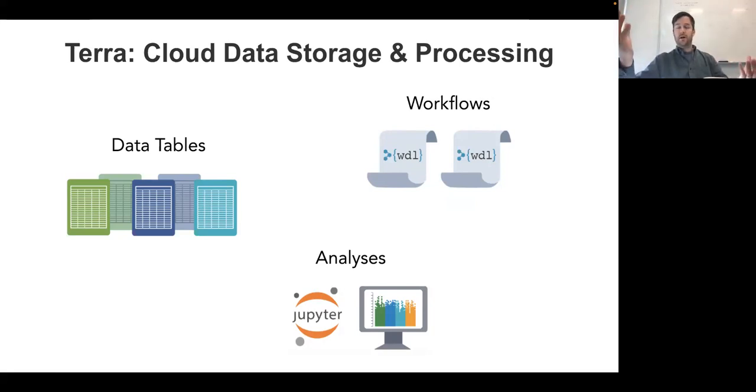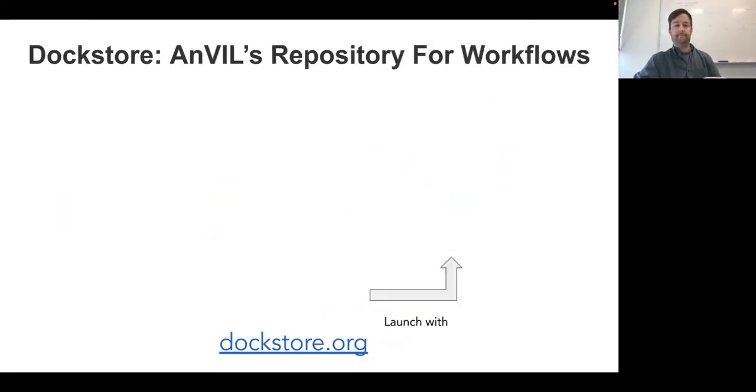So if you run 100 jobs, you maybe don't want to go through them one by one and check to make sure that they work. You can use a Jupyter notebook to download the data from the resultant QC file, for instance, and then you can check it to make sure that each and every one of them works okay.